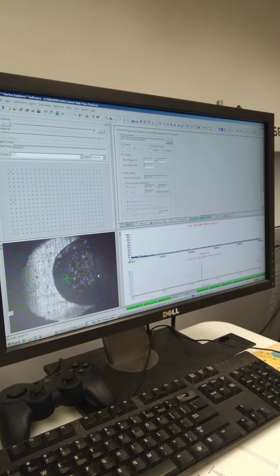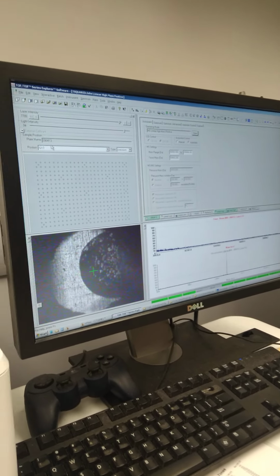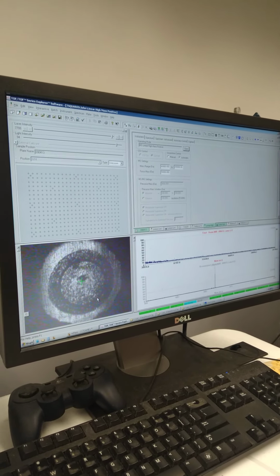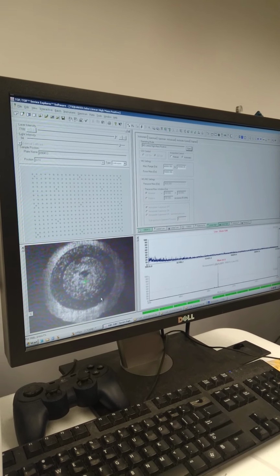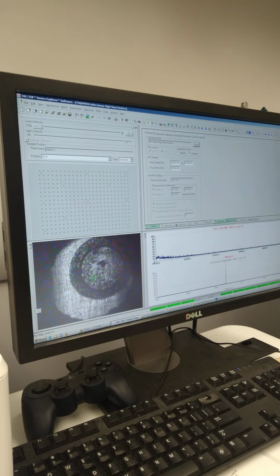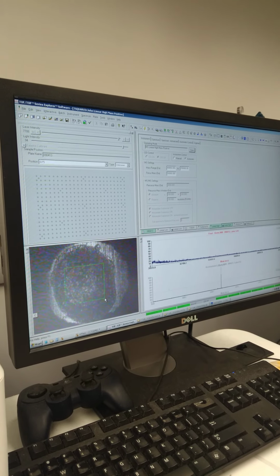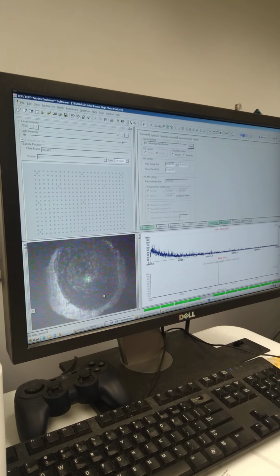Does not look great. And then let's go to your next spot down the road, because maybe it's too concentrated. Let's look at the next one. So just click on it there, yep, or there. Then go ahead and box that one and fire. Yeah, it looks like we're not seeing it there. And then I would just try the last one just for fun, but it's probably not going to work. And then let's try out the sinapinic acid matrix. It's starting to look maybe a little bit better.